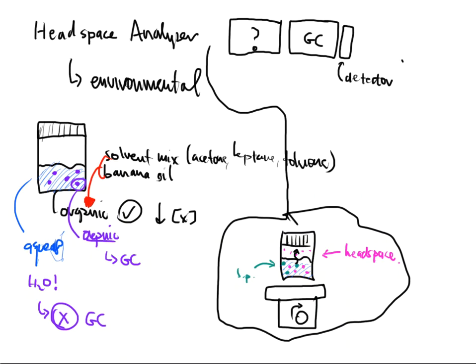All right, so if you've taken our forensic chemistry course, you probably experienced a blood alcohol content lab. And the blood alcohol content lab used the Headspace GC TCD unit or FID unit. We actually have both of these detectors on our Headspace system.